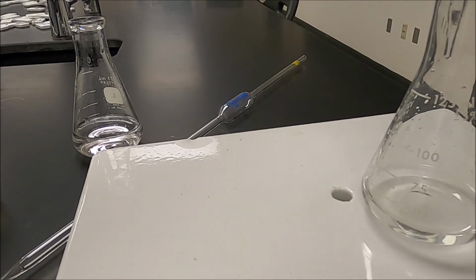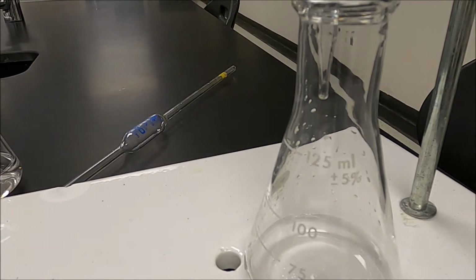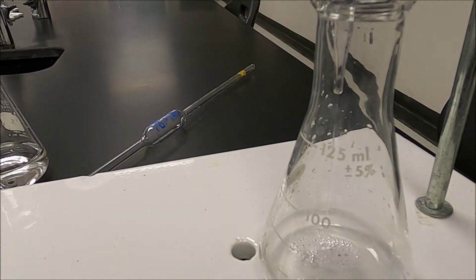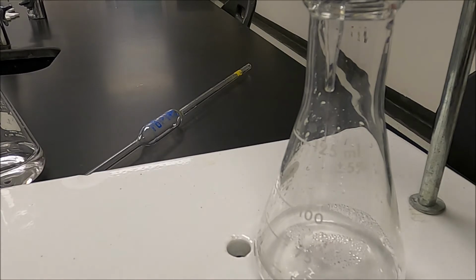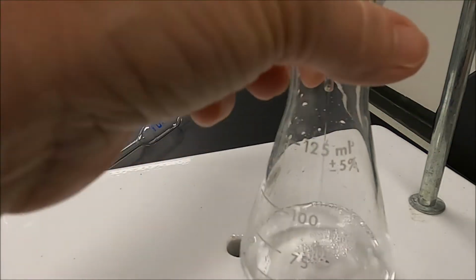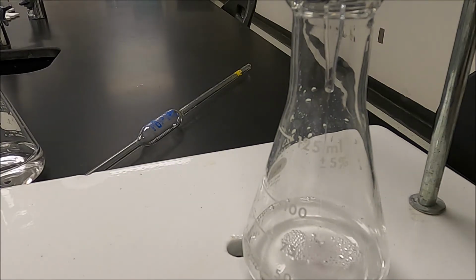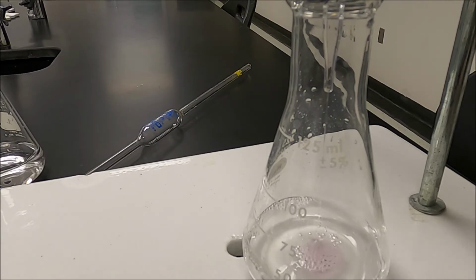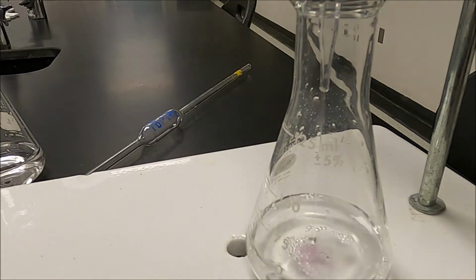and now I'm going to do my second. Now, I know that I have 50 milliliters in here, and I'm starting out at 23.00, so that should be no more than 46. So I should be good to just run with the burette as it stands. I'm going to let it run down to 45 very quickly, and then I will slow down for that last milliliter. Okay, I'm down to 33.